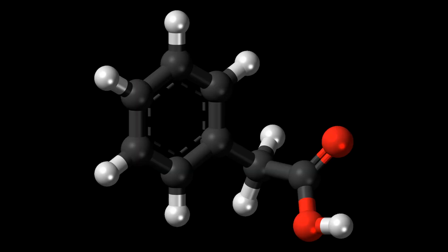The most common type of titration is acid-base titration, which involves the reaction between an acid and a base. The titrant is usually a strong acid or base, such as hydrochloric acid or sodium hydroxide, while the analyte is the acid or base being tested.